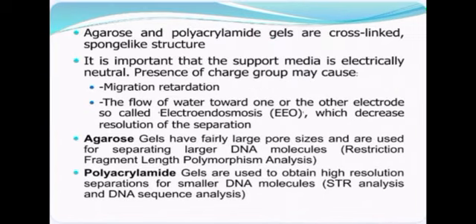Second factor, gel. Agarose and polyacrylamide gels affect gel electrophoresis. Agarose gel has a very large pore size and is used for separating larger DNA molecules. So agarose gels affect gel electrophoresis.